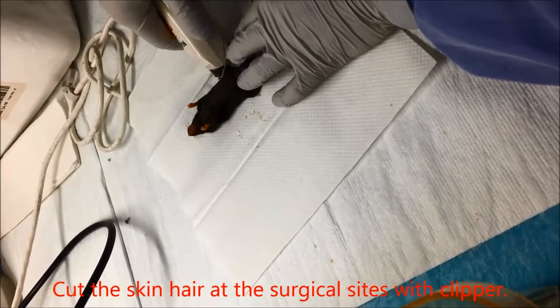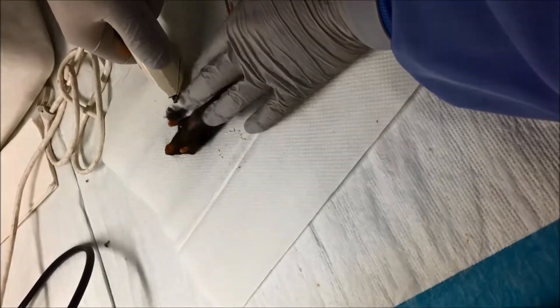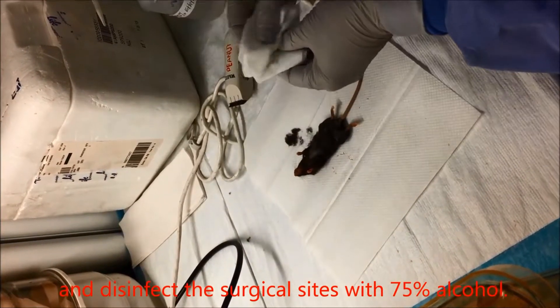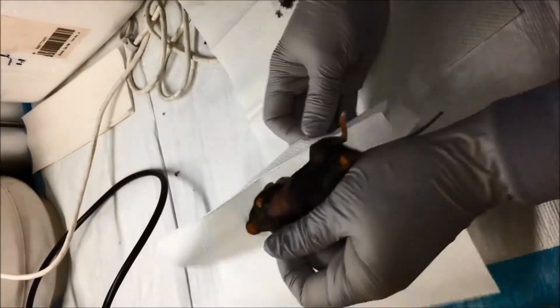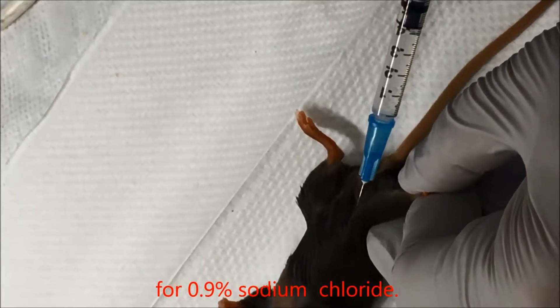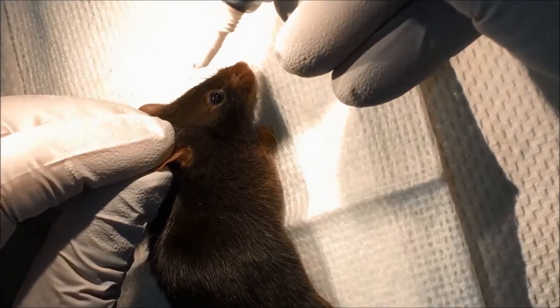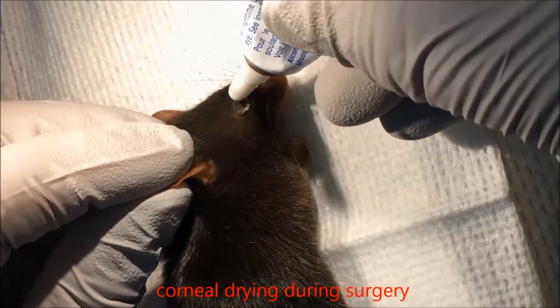Cut the animal skin hair at the surgical sites with a clipper. Clean the cut hair and disinfect the surgical sites with 75% alcohol. Inject carprofen subcutaneously and do intraperitoneal injection of 0.9% sodium chloride. Apply eye gel to keep the eyes moist and prevent corneal drying during surgery.